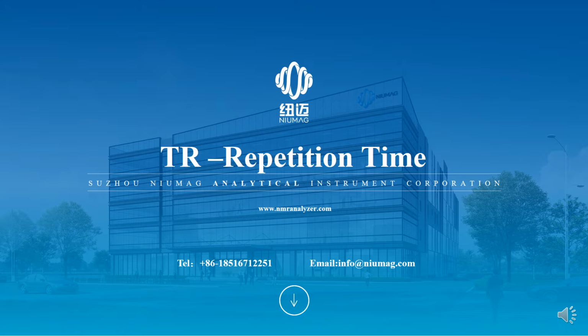Within MRI, there is T1 weighted, T2 weighted, and proton density weighted imaging. Weighted imaging is all related to the TR setting. In relaxation analysis, we also need to set the appropriate TR value when testing T1 relaxation time and T2 relaxation time or T2 mapping.